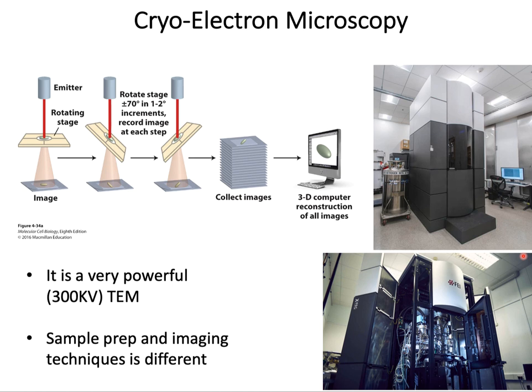All this labor-intensive, months-long work is solved with much higher resolution by this state-of-the-art cryo-EM.